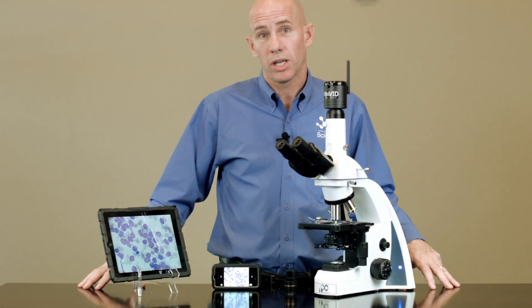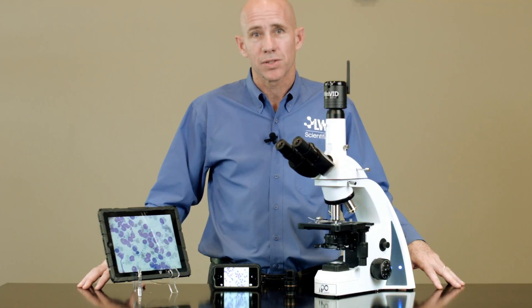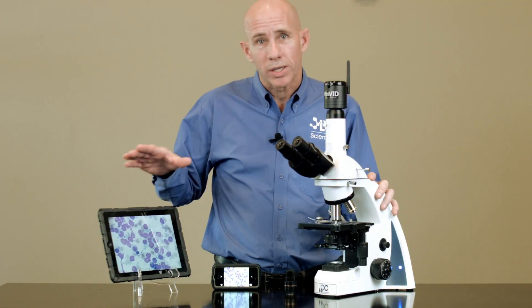Veterinarians and technicians will love showing ear cytology or fecal parasite images to clients using their smartphones or tablets.